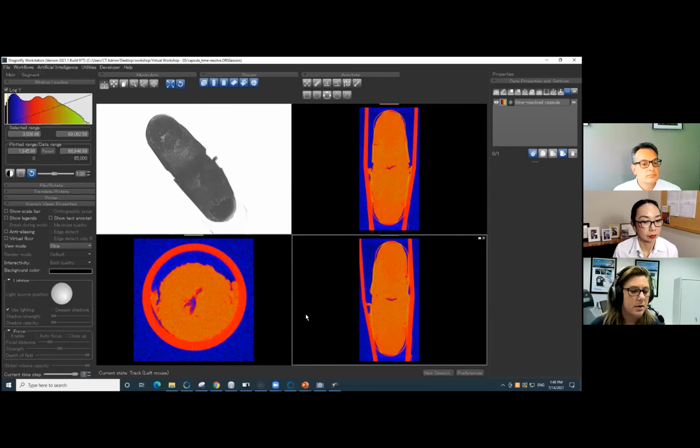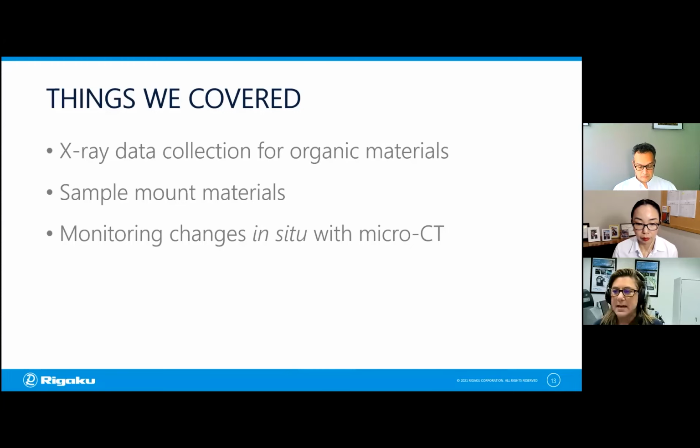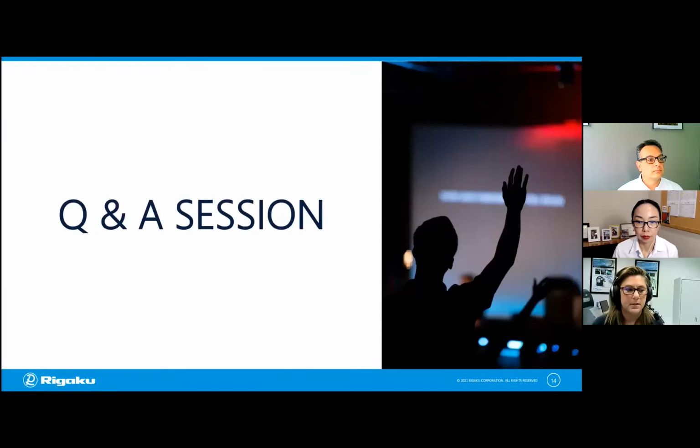All right, and with that, I want to go back to our PowerPoint presentation where we want to wrap things up essentially. So just to recap today's workshop, the things that we covered were some data collection for organic materials. We looked at some different sample mount materials, and we did a quick time resolved experiment with our painkiller pill. And with that, I'm going to wrap things up, but we do have some time for more questions.